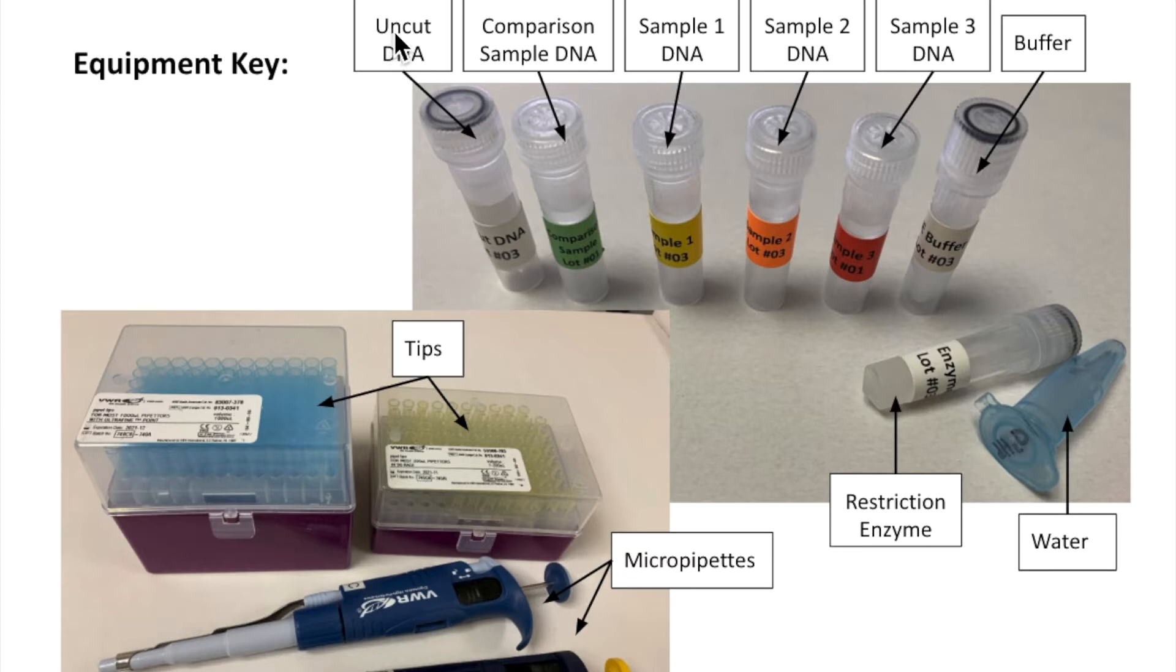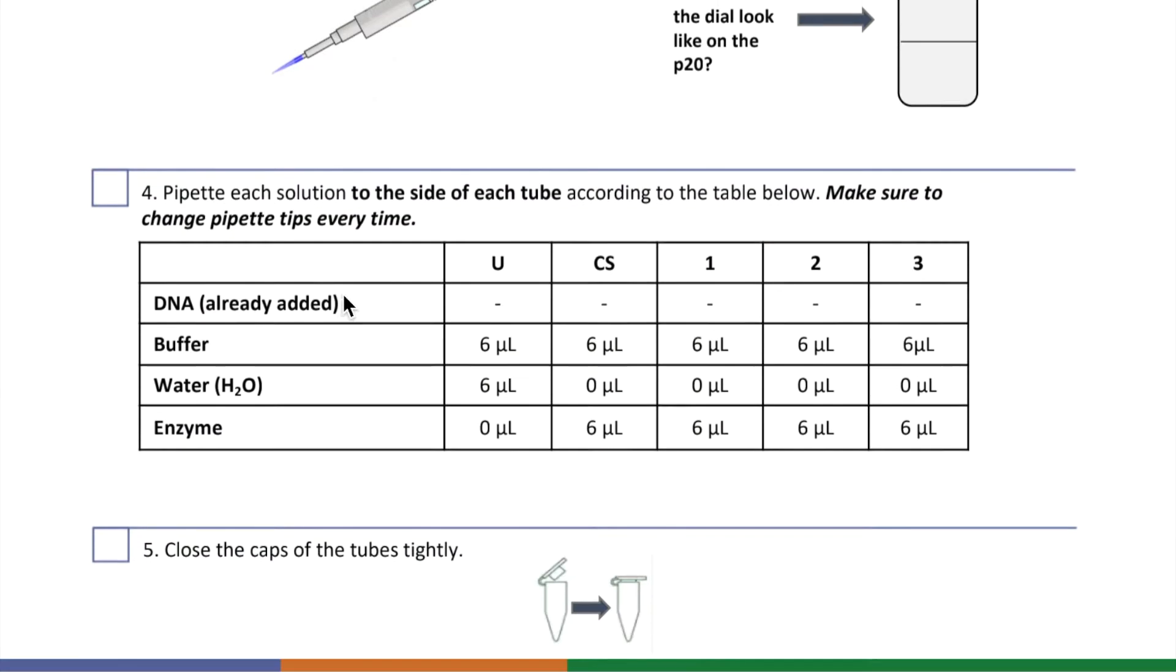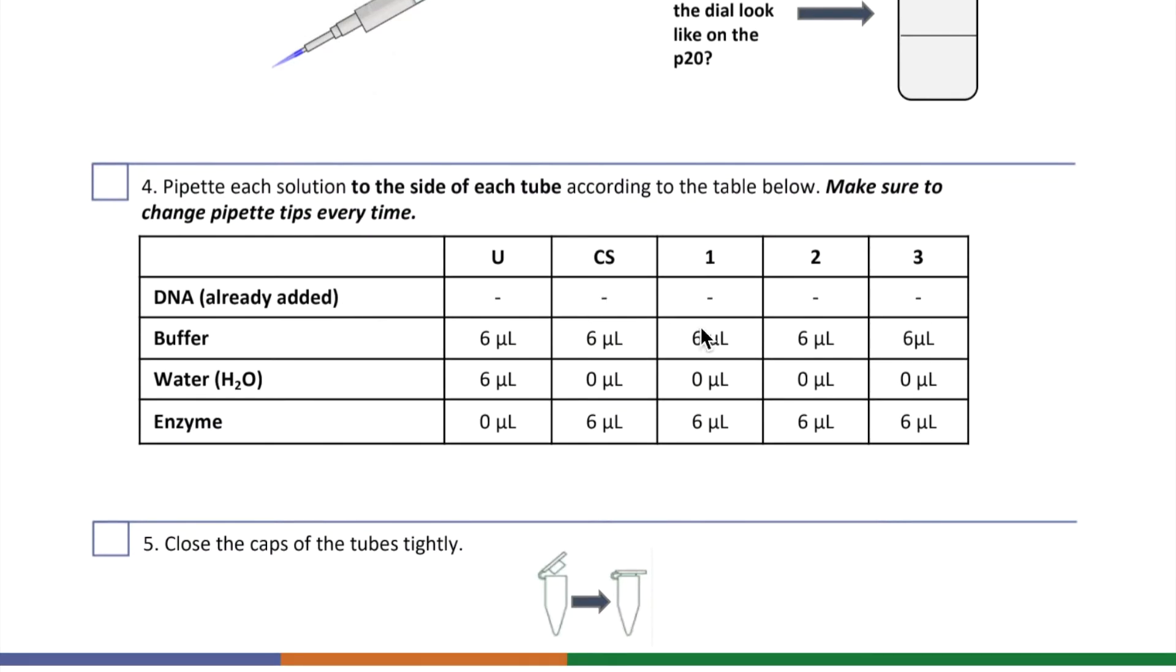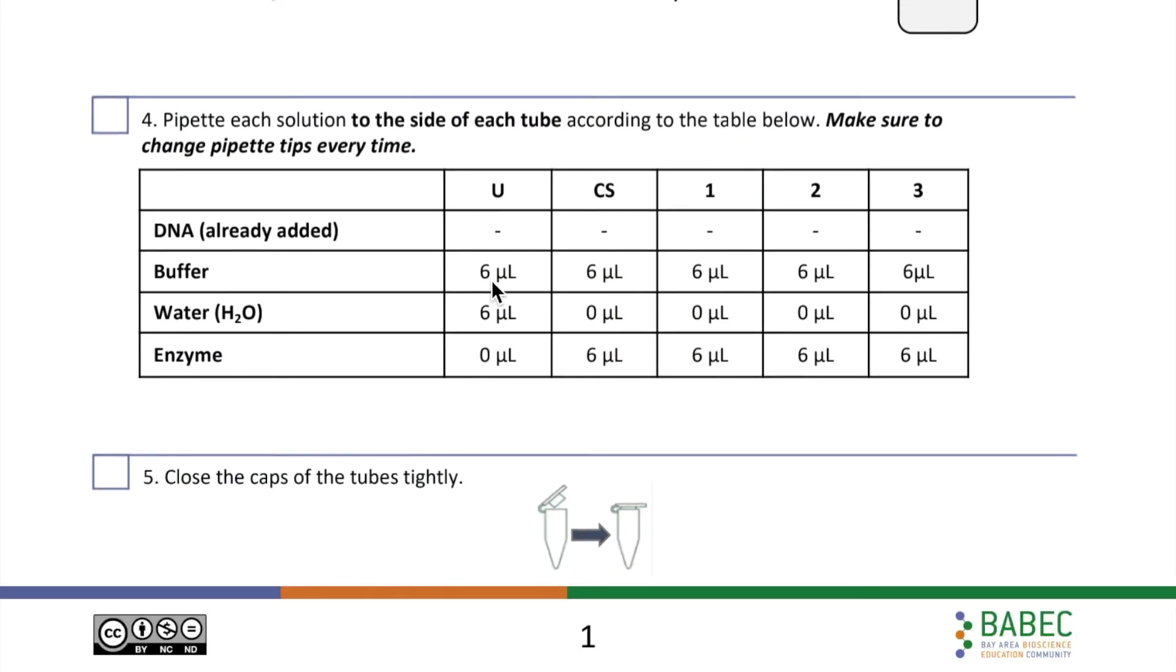When we join the video, we're halfway through Step 4 in the protocol. We have the DNA in each tube. Then we've already added 6 microliters of buffer to each tube. The buffer helps the Restriction Enzyme cut DNA. You'll be watching the last two parts, adding the water and the Restriction Enzyme.